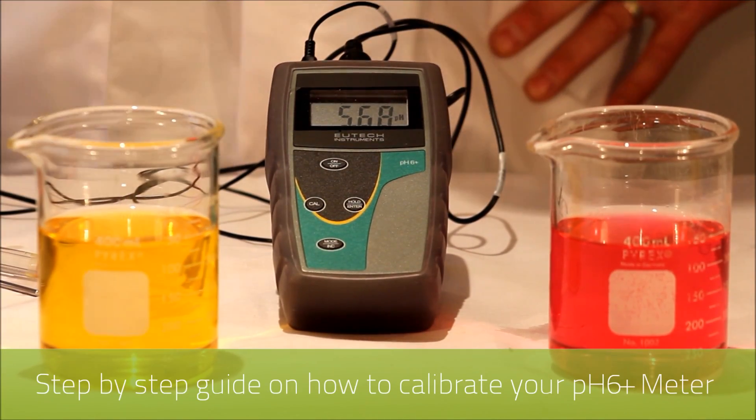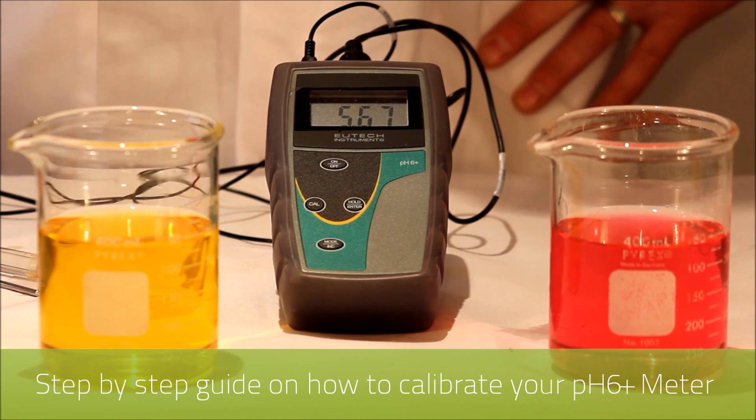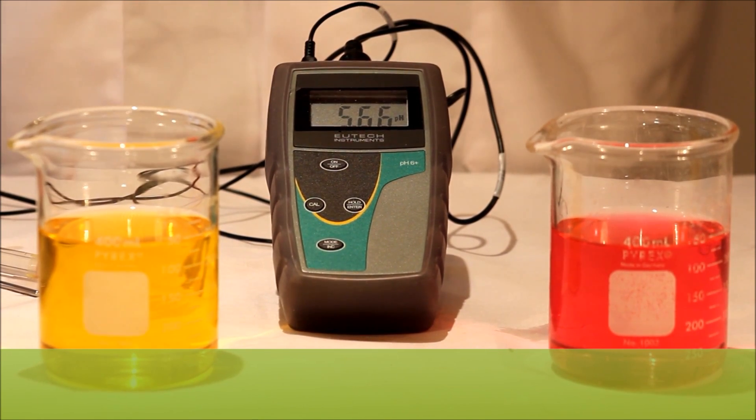Welcome to RMS. This is an informational video on how to calibrate the Utec PH6 Plus portable instrument. For this you'll need your buffer solutions and deionized water for cleaning between the buffers. Today we are using seven and four pH buffers.